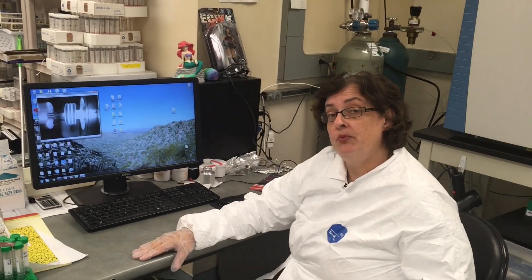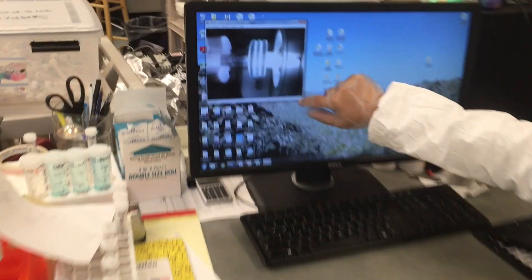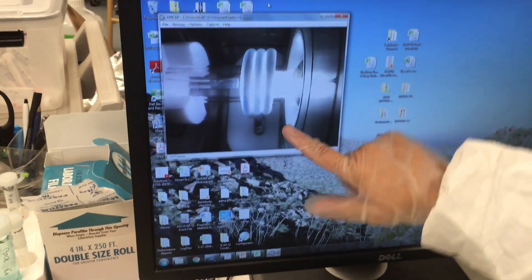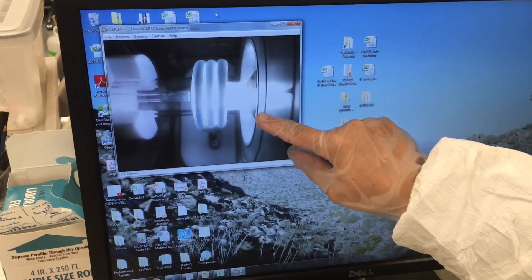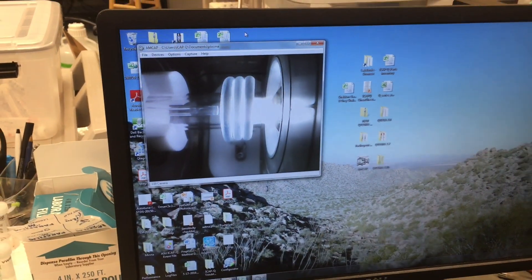This instrument actually has a camera so you can see what the plasma looks like, and that's shown right here. This is the load coil, and that's where all the energy is flowing. And then this is actually the plasma. This end here is the cone — there's a very small hole that is the inlet to the instrument.